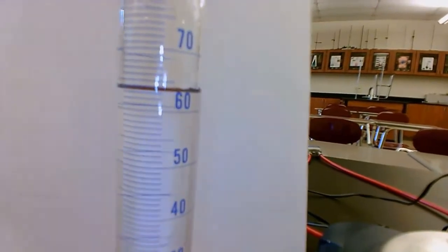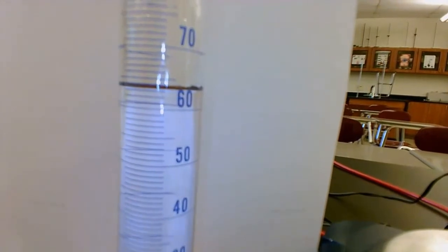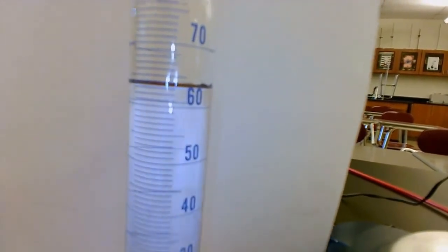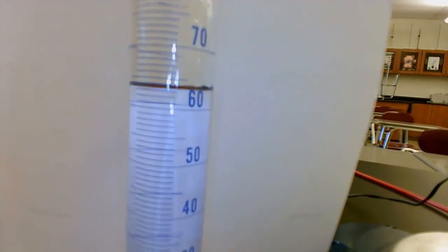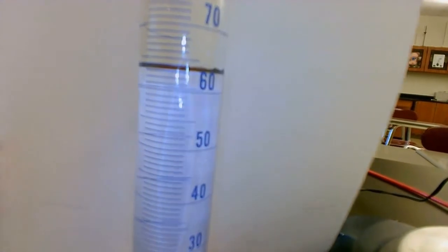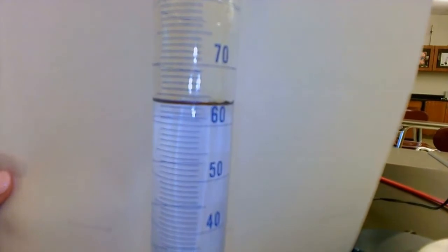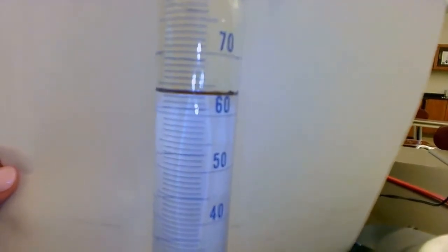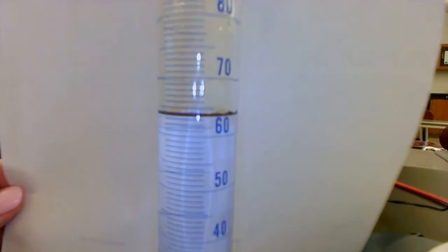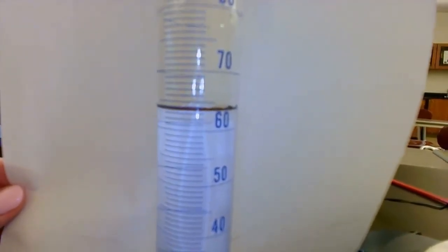So this is your graduated cylinder. Take a good look at it. Count your lines. Make sure you take it to 1 decimal place. If the bottom of the meniscus is right on a line, then it would be a 0.0. If it's a little bit above the line, you have to guesstimate. Is it a 0.2? Is it a 0.3? Is it a 0.6? Remember, that decimal place is a guess, so don't be afraid to guess a number. Record this volume down in part B.